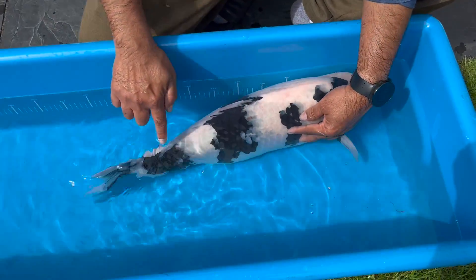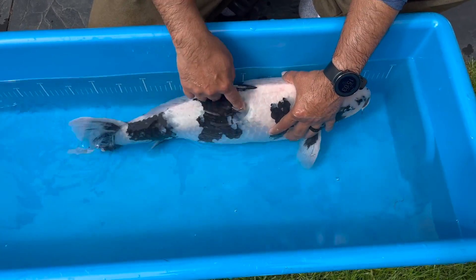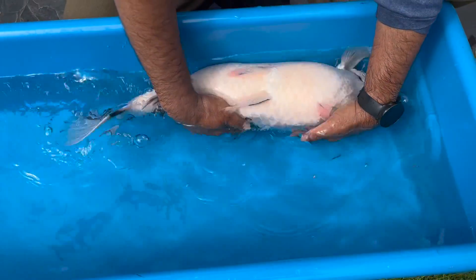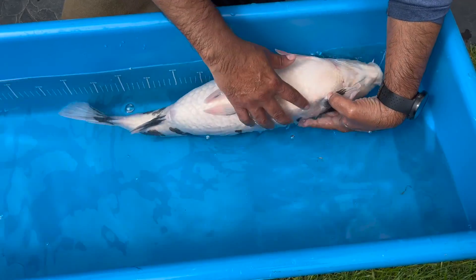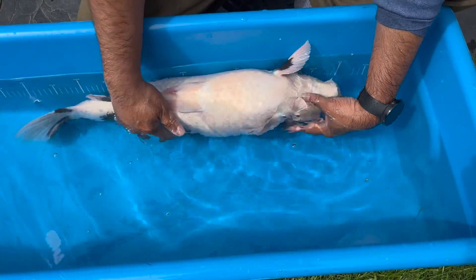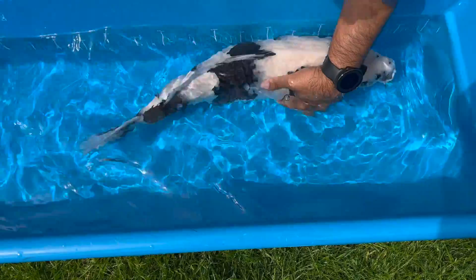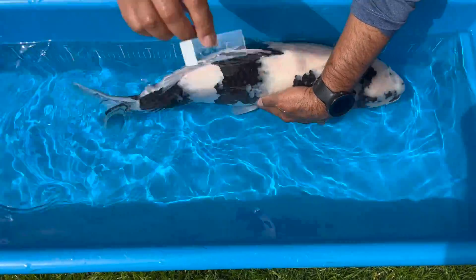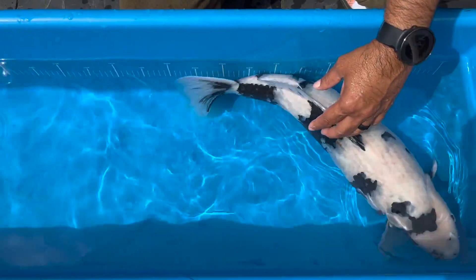When we're scraping the fish, we want to start from the head to the tail, going with the scales, not against them. We take a scrape from the dorsal area, and then we gently roll the fish over. There you go — can you see some mucus there? So that's one scrape. I'll set it aside.